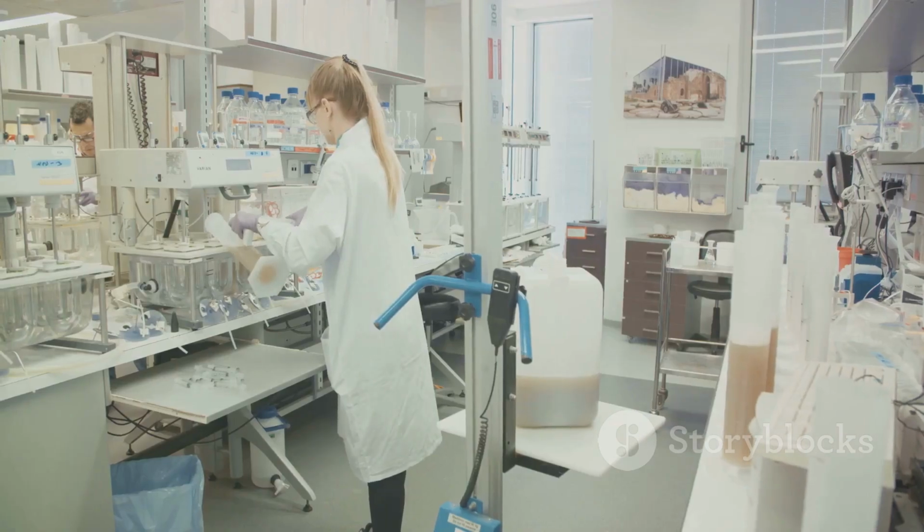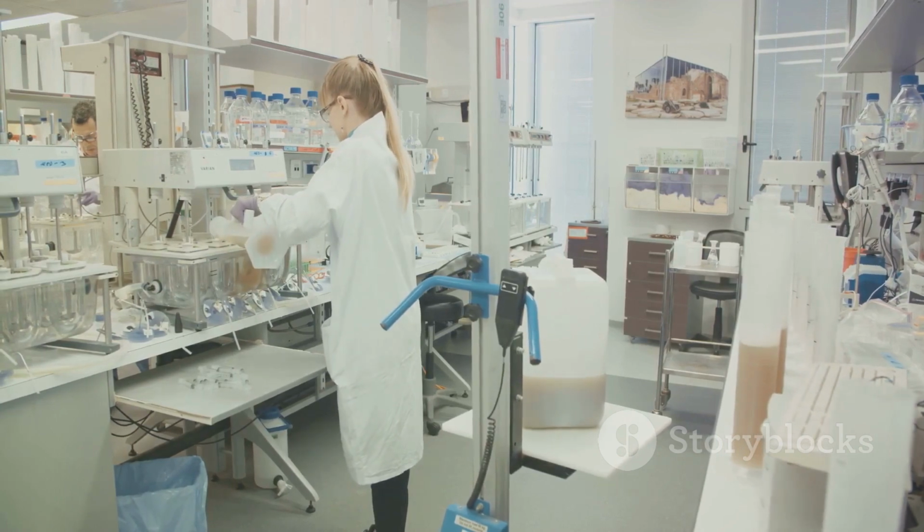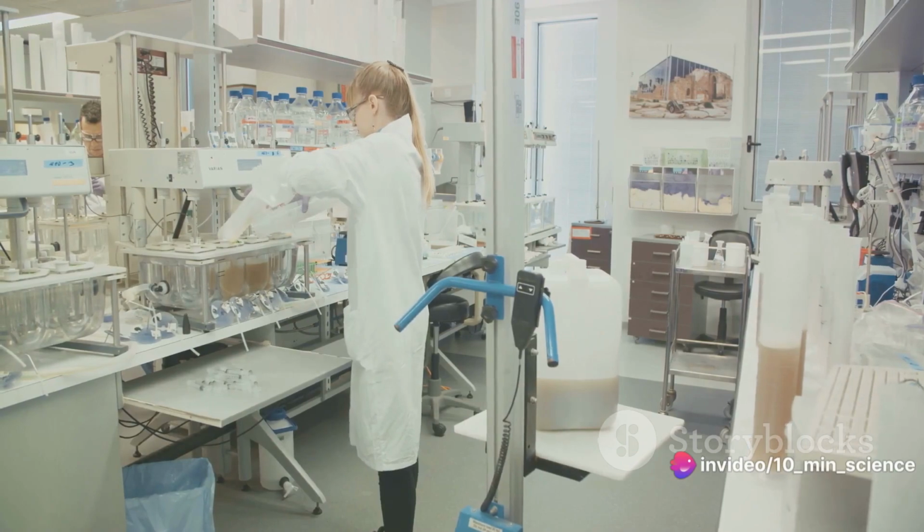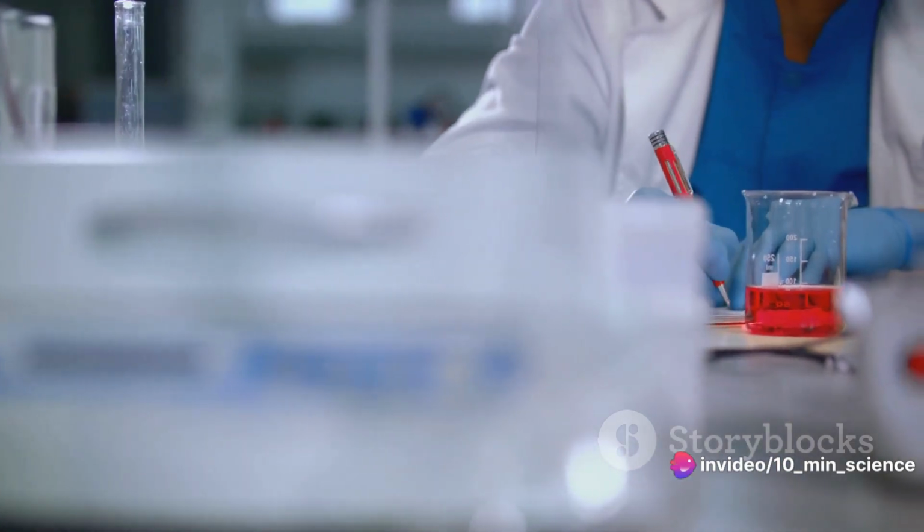Well, the answer lies in the magic of chemistry. The sample is subjected to a series of reactions where it is first treated with hydrochloric acid and then with a calcium solution. The hydrochloric acid helps to break down the alginates into simpler compounds, while the calcium solution triggers the formation of a gel. Now, this might sound complex, but it's really a beautiful process.